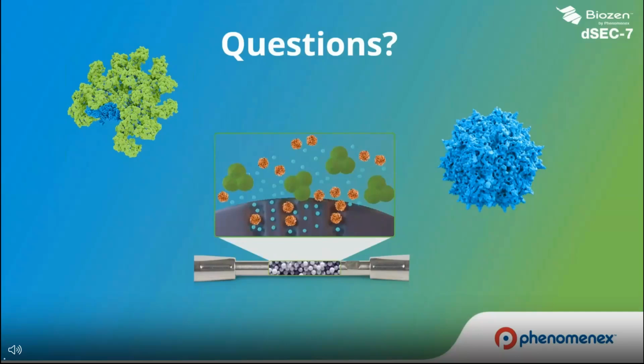Yeah, this is a great question. So these high flow rates, if you look at what is commercially out there, some 7.8 mm columns actually run at 1 mL per minute or even higher. So when I'm doing method development, I often look at the percentage monomer or the aggregates that are recovered at different flow rates. As of now, I would say I haven't seen any effects on the AAV or its associated impurities up to 0.5 mL per minute.